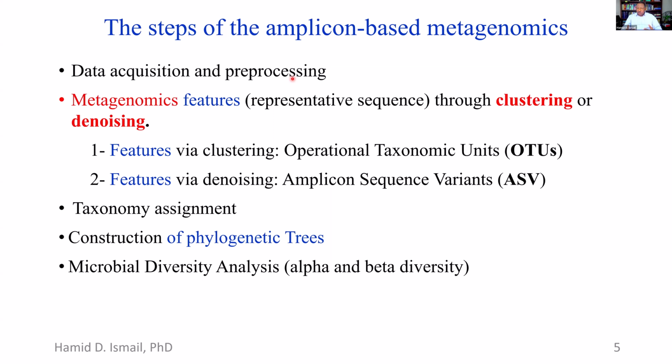And after sequencing, that barcode also will be sequenced. So it will be very easy to separate the samples from one another. So if you have 100 samples, we can separate or read them with those specific barcodes, and we can put them in separate FASTQ files. So this is what we mean by demultiplexing and pre-processing.